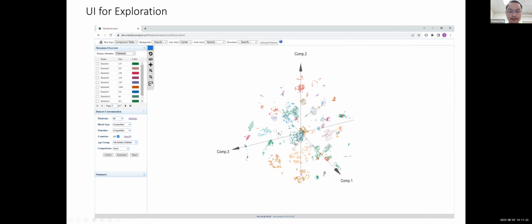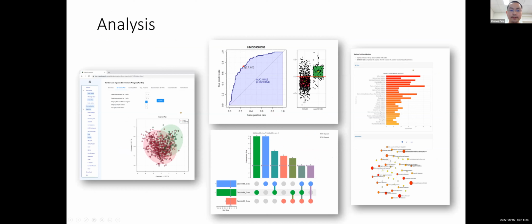After that, they will get a lot of various analysis results. For example, they can show the different patterns among different groups, and find some biomarkers, pathways, and networks. And they can also use the meta-analysis to do meta-analysis interpretation on the datasets.